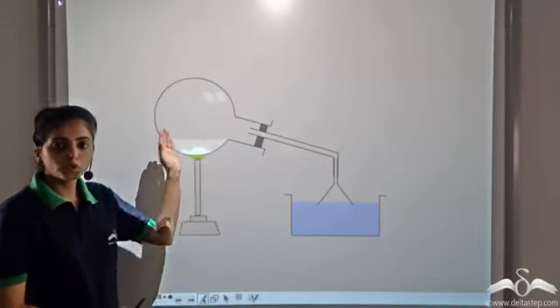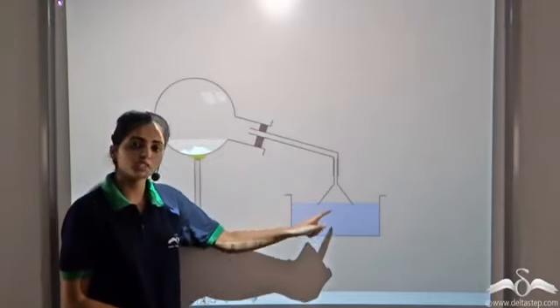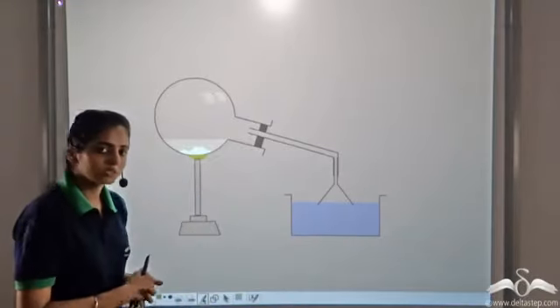So now as more gas is produced, it pushes the funnel back as it pushes the water down. So the funnel again regains its contact with water. So let's see how this is happening.